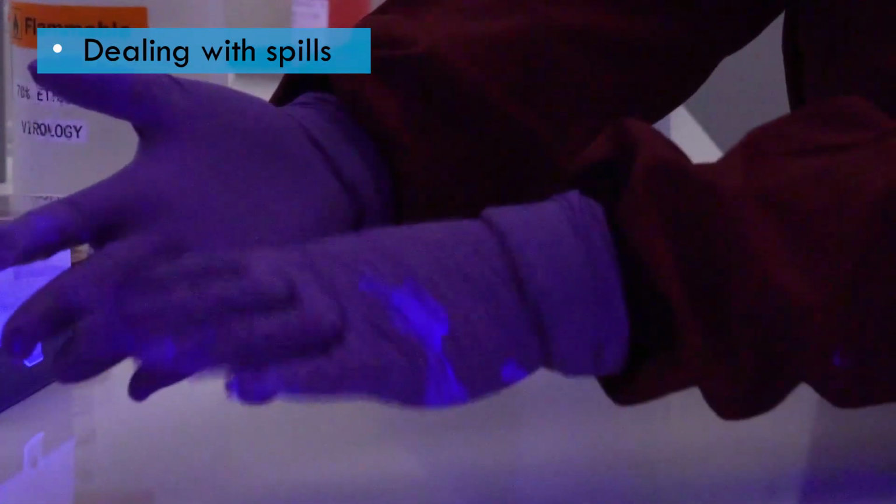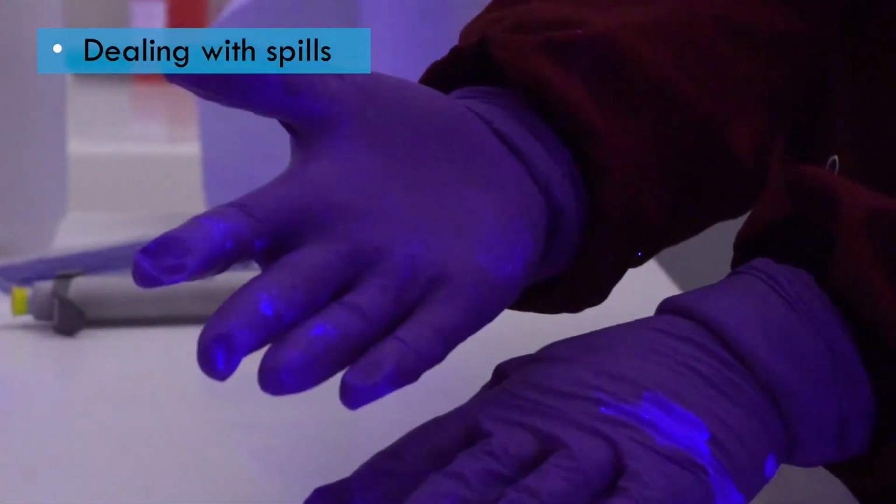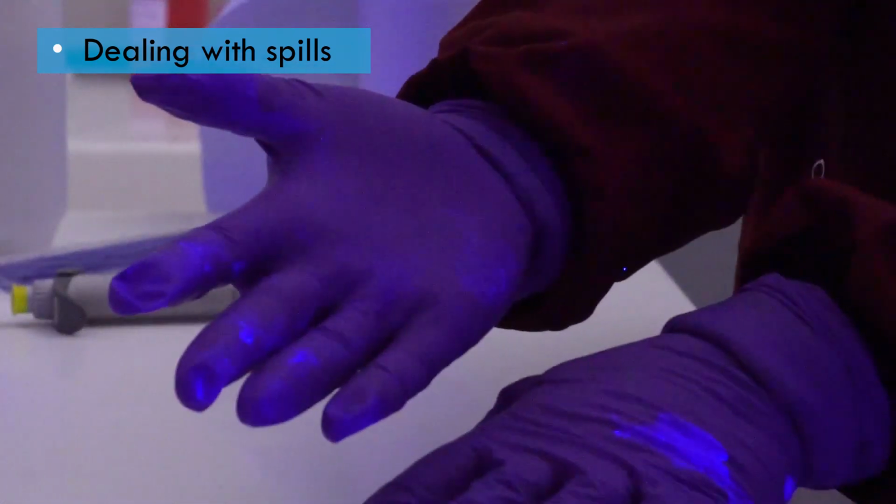You must always wear appropriate gloves for dealing with a spill, and these must be changed for fresh gloves before resuming work.